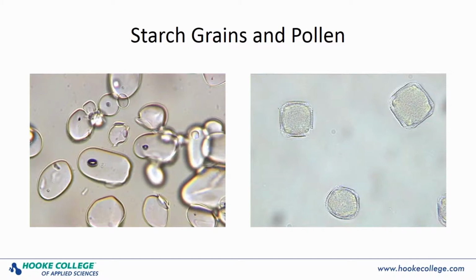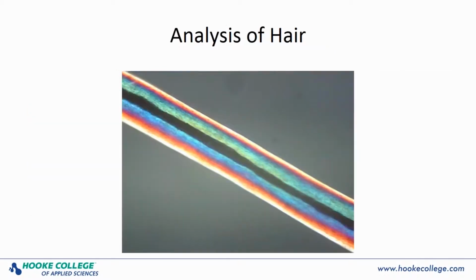With good resolution, fine detail can be used to identify animal hair, diatoms, starch grains, pollen grains, phytoliths, trichomes, plant fibers, etc. For instance, the medulla and/or the scale pattern of a hair can be used to identify an animal species, or the size and shape of a starch grain can indicate its source: potato starch, cornstarch, wheat starch, etc.